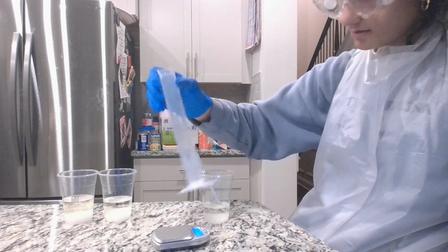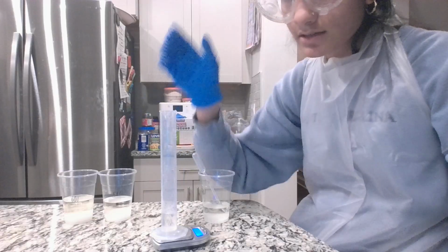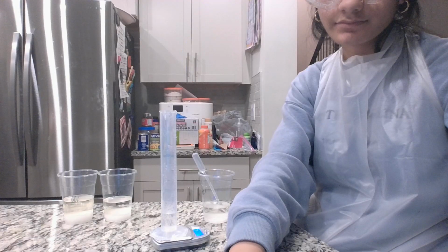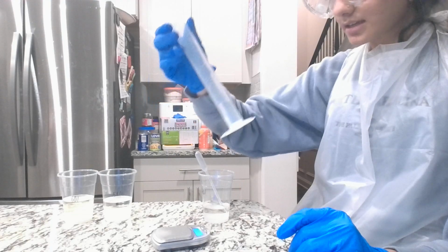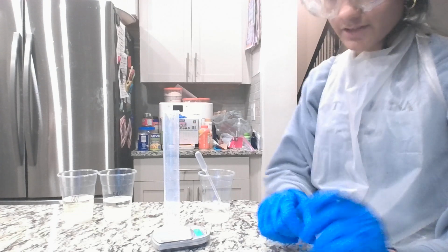This is 10 milliliters, and it weighs about 41.28 grams. This is 15 milliliters, and it weighs about 46.74 grams.